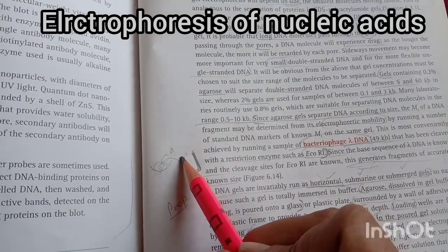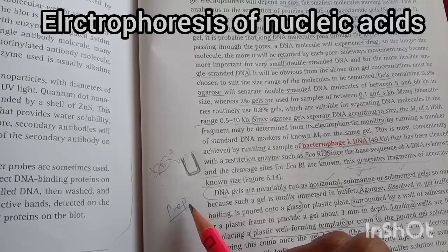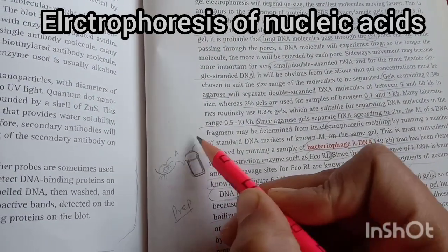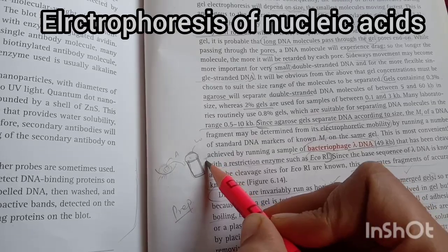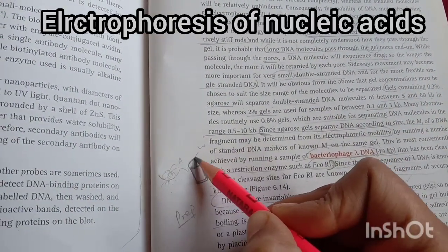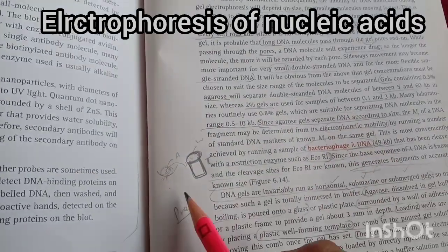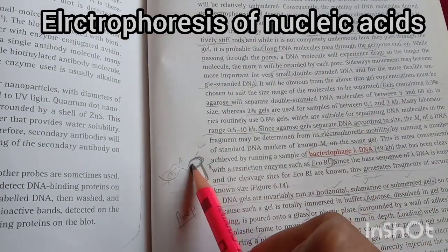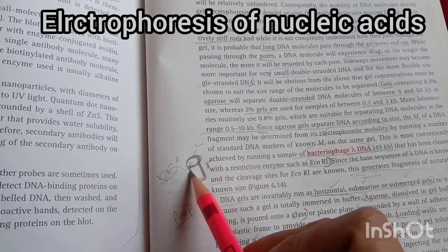After that, we load the plastic well-forming template. This is the plastic well-forming template. This is a well, this is the adhesive tape. This is a well. I am just drawing here for understanding, okay? Do not write this in your exams. So here we use a plastic well-forming template.